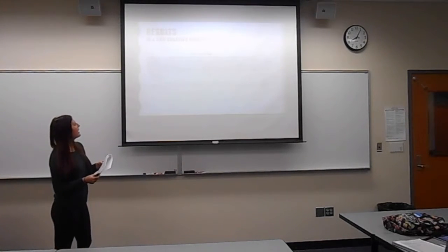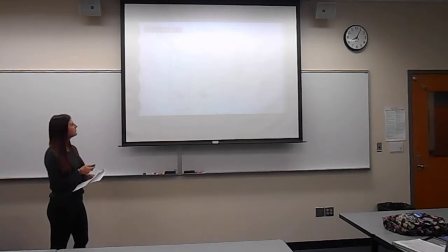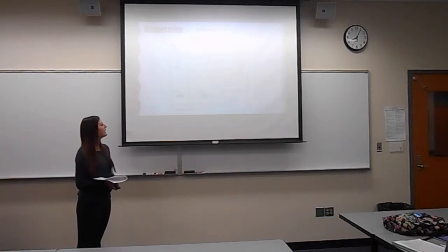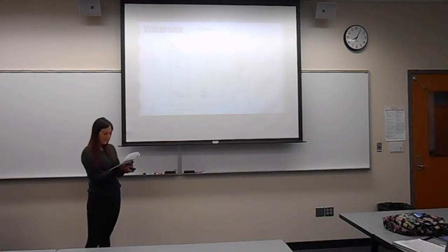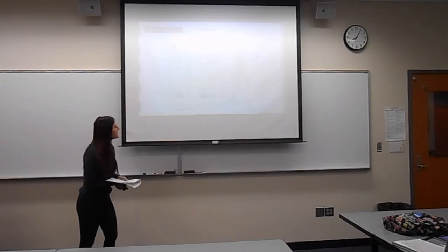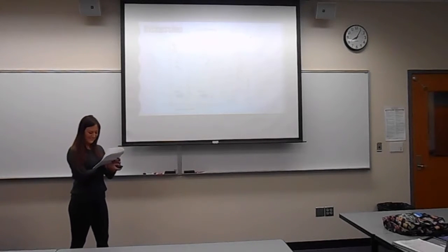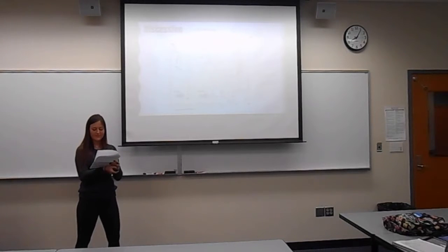Here's a chart of my IR and NMR unknown readings, but I will further explain them. For 37I IR reading, it was shown that there was a carbon singly bonded to a hydrogen because the wave number was 2,993.20.